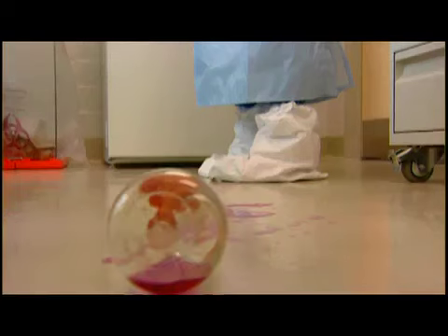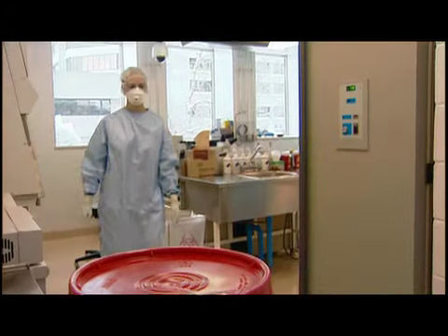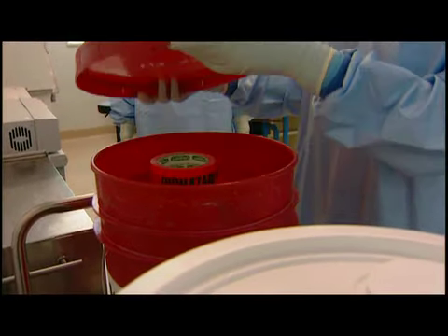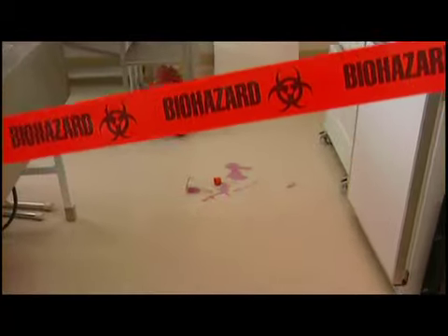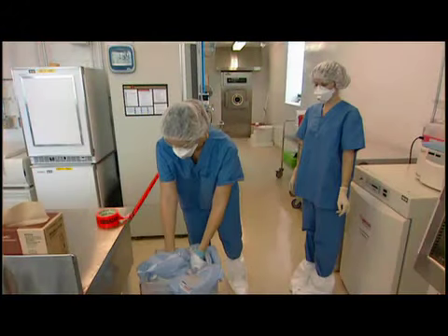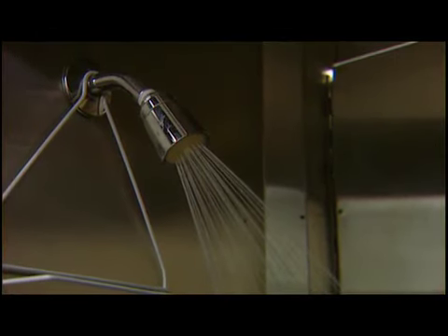If the spill occurs outside the BSC, stop work immediately. Warn other staff members to exit the lab immediately. Locate the emergency biological spill kit. Cordon off the spill area with caution tape. Remove outer gloves and gown. Shower before leaving the containment area as per your SOP.